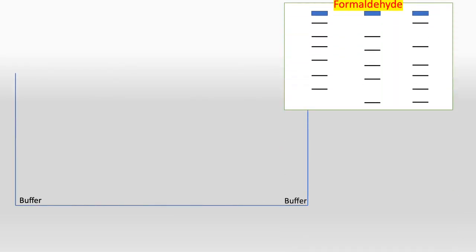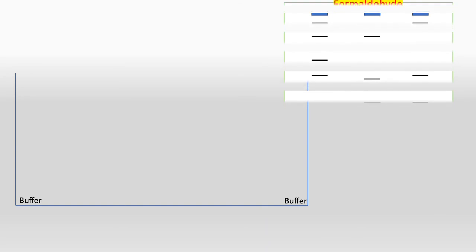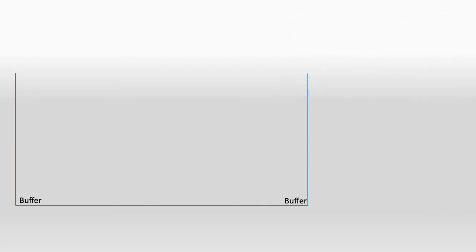We take this gel and put it in the tank to start the process of imprinting or transferring the content of RNA from the agarose gel to the filter paper. And that is when the term blotting comes in. Blotting is the imprinting of a gel material onto the paper. This blotting technique of northern and southern blotting is very similar, because both techniques use the process of capillary action for transferring the content of DNA or RNA from the gel to the membrane filter paper.